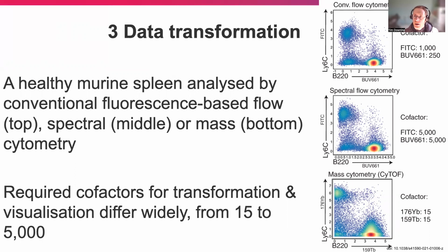You can see here for the top one, we have certain cofactor parameters for each of these that differ across the different experiments. They're all not the same, even though the variable labels on each of the axes are the same. What you can see at the top right is the clear separation into 3 major groups, with really nothing here on the right. But there's quite a lot of samples that are intermediate here and don't clearly separate. We get the same pattern in the second image, and a comparable pattern in the bottom image. But note, for each of them, the cofactors differ widely.